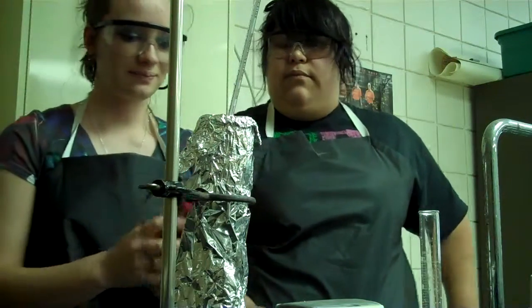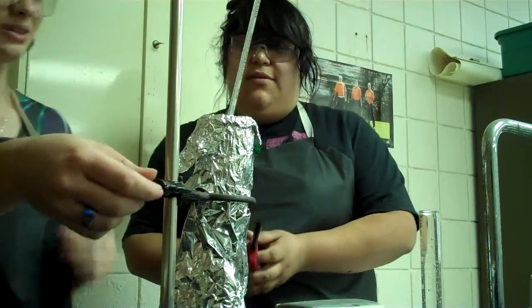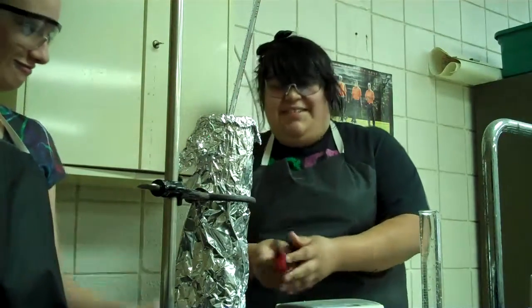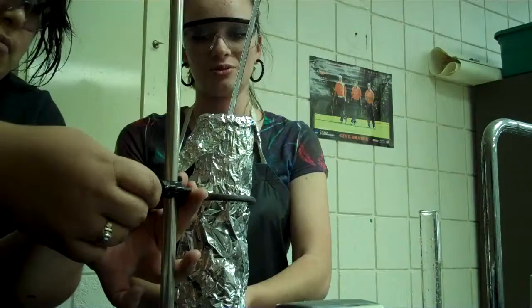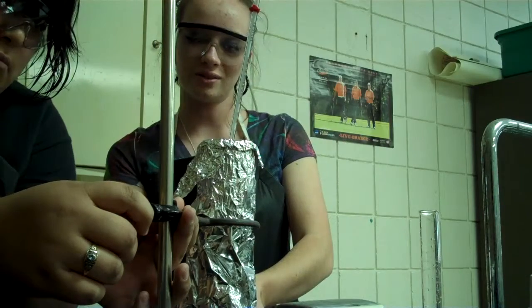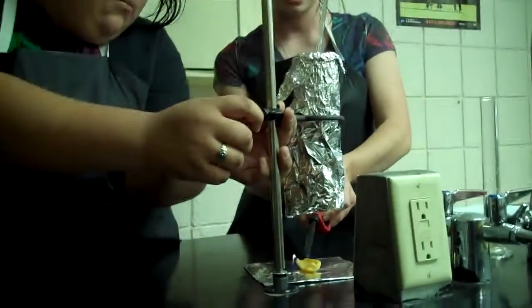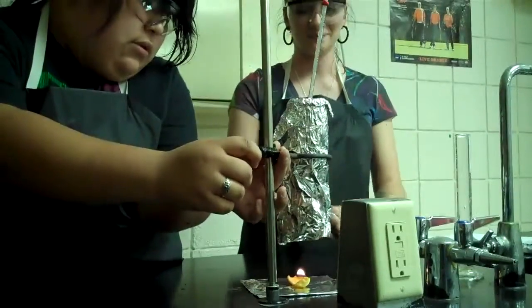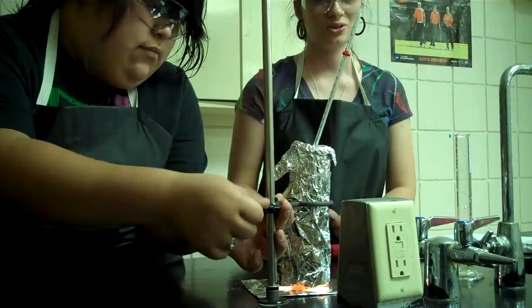Now we will light the Frito and lower the calorimeter on top of it. I'm trying to get this to work. Some heat will be lost in this process. It will light — I think it's lighting, slowly. After we lower it on there, we will let it burn and record the highest temperature.